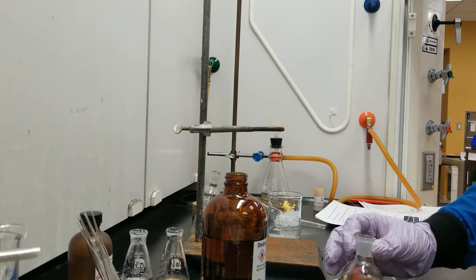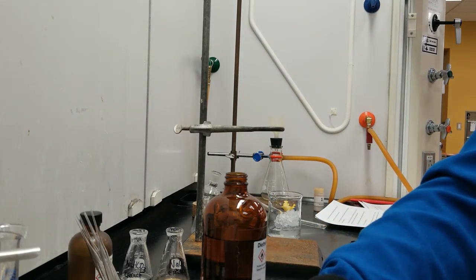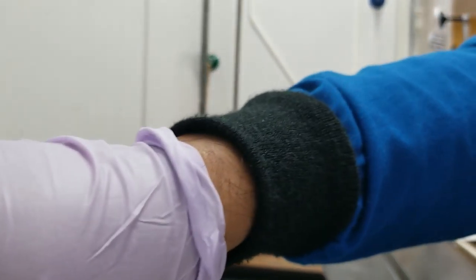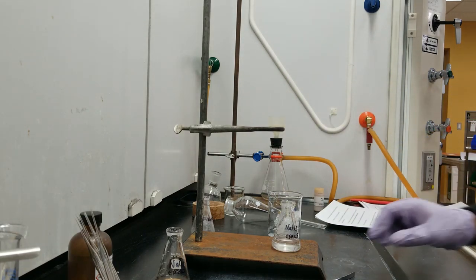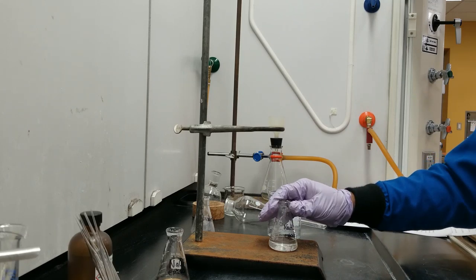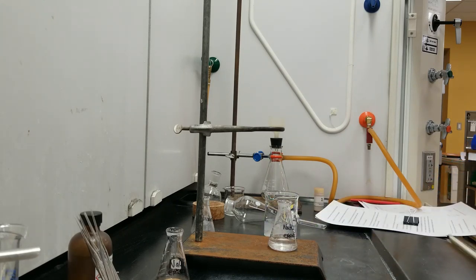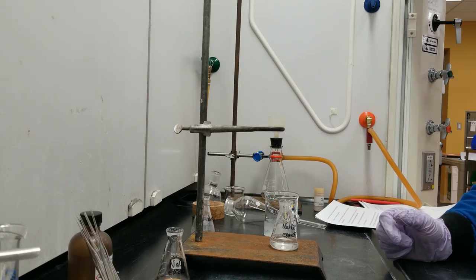This is the slightly basic component of our solid mixture. Now we keep it aside and we work with the first extract that we made, that is the sodium bicarbonate extract, to isolate the 3-chlorobenzoic acid component of the mixture. So remember, the sodium bicarbonate extract contains the sodium salt of the acidic part of our solid, that is 3-chlorobenzoic acid, as the sodium salt is soluble in water.